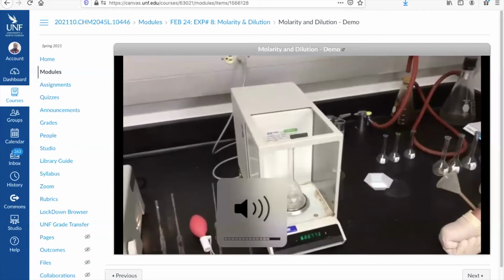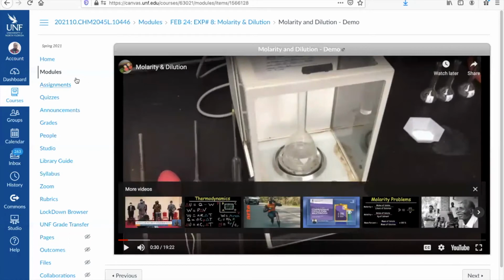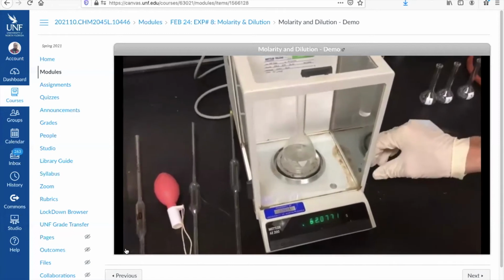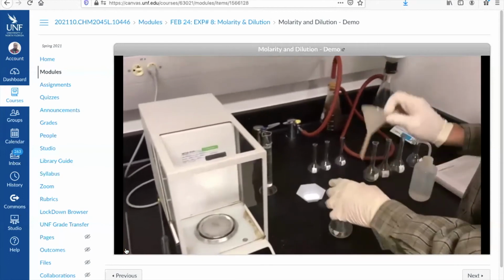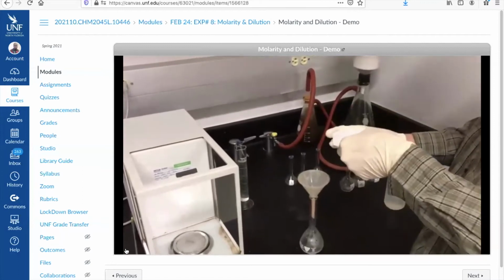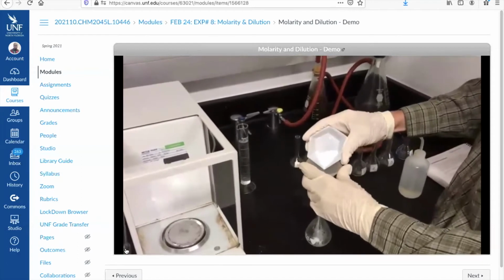We have 62.0772 grams. So if I were you, I'll pause the video, like right now, I stopped the video, and I can record the mass of the empty flask. That's what you need to take note of. And I have pre-weighed some copper sulfate here in the weighing boat. It's a little over 3 grams. We will check that again once I get it all added here.